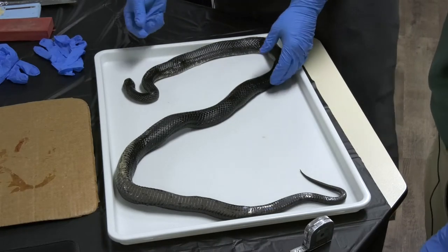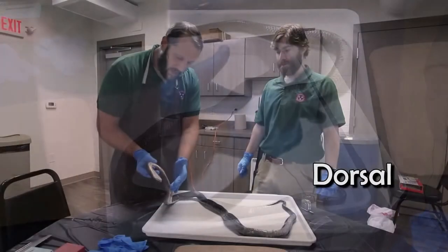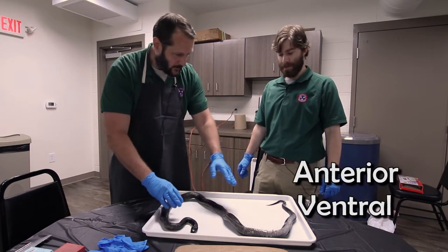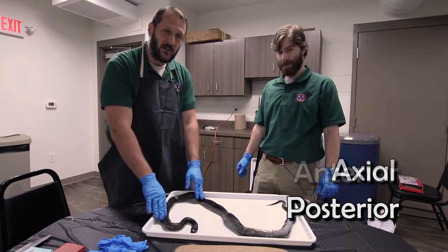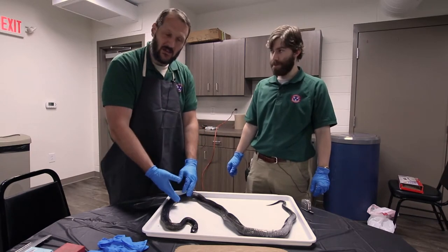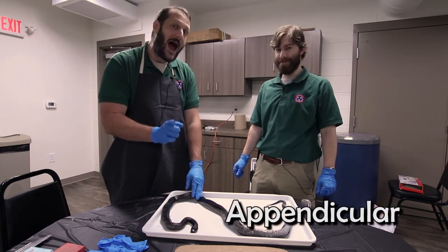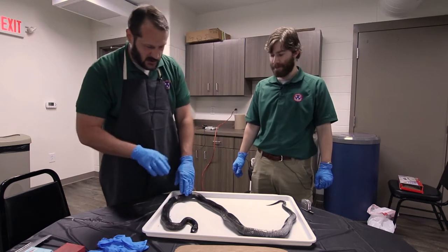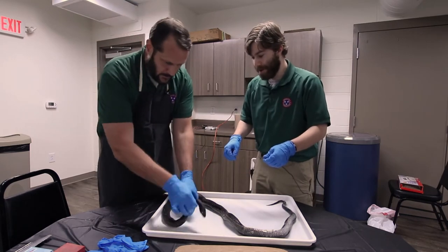Some quick anatomical terminology. You refer to the top of an animal as the dorsal surface, whereas the belly we call the ventral surface. The head end is anterior, the tail end is posterior. Things along the back or the midline we refer to as the axial portions of the animal. But one key difference is that this black rat snake is missing the appendicular elements. I'll let you use context clues to guess what appendicular means. Arms and legs. But everything else, we'll find some similar structures in here that you'd see in a mammal or some other animals. All right, so if you can straighten some sections out and I'll measure them.